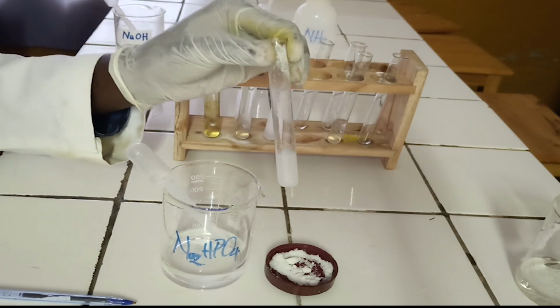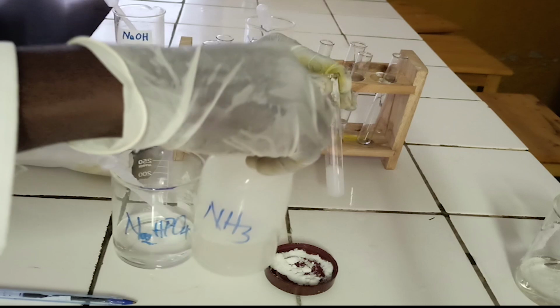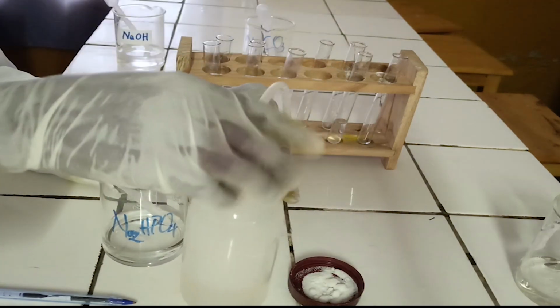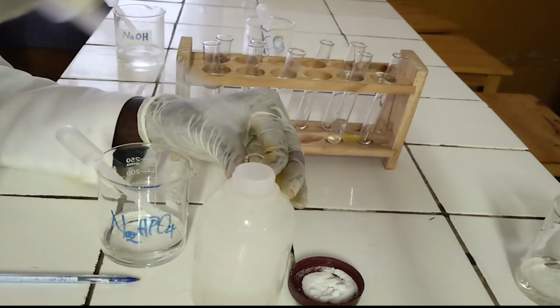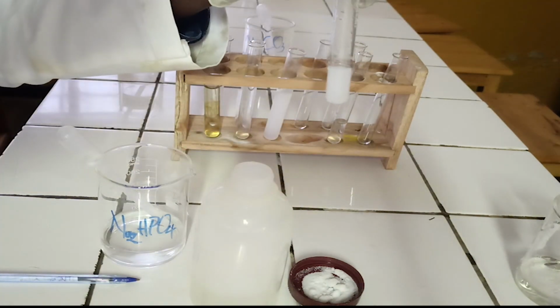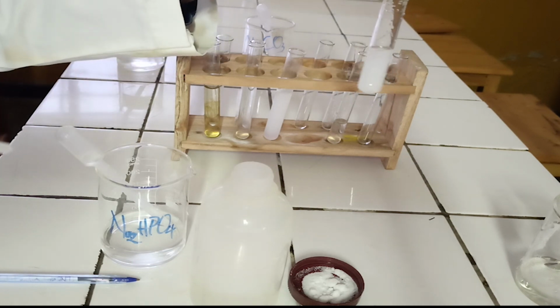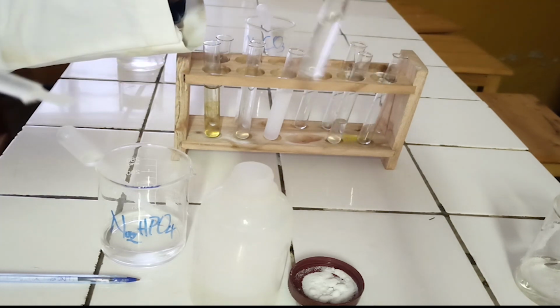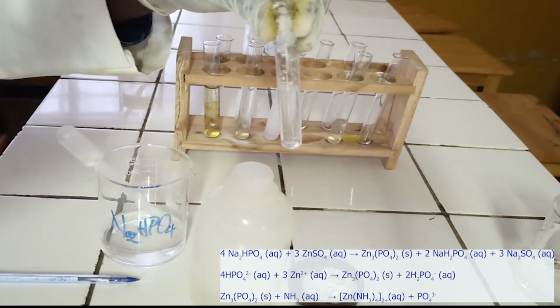As you see, disodium hydrogen phosphate reacts with zinc ion to form white precipitate which is soluble in excess of ammonia. Below, there is chemical equation and ionic equation for this reaction.